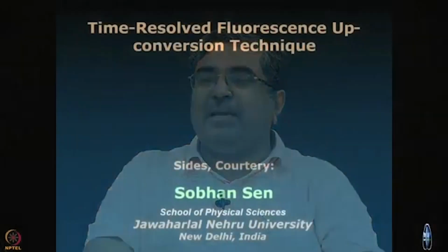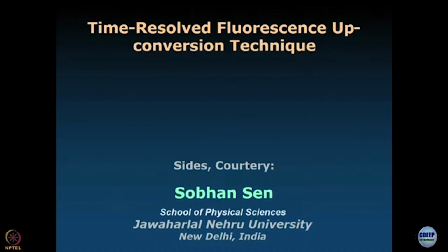not better. And this technique is called time resolved fluorescence upconversion, or the name I like better is femtosecond optical gating. The reason why I do not like the term fluorescence upconversion is that there are many people working in the area of material science who want to make upconversion materials, materials in which 2 photons of smaller energy would join up to give you 1 photon of higher energy, and the moment they see the fluorescence upconversion technique, they come and ask me, is it possible for us to test our samples on your equipment? Of course, it is not possible to test their sample on our equipment.